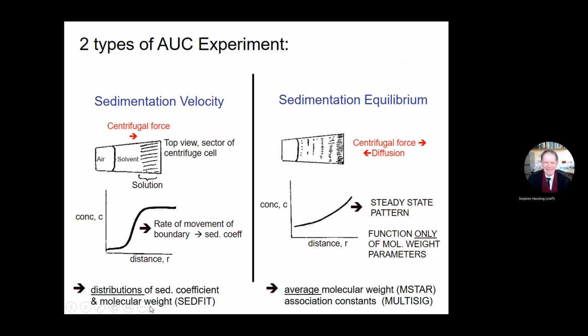If you know, remember this, the sedimentation coefficient molecular weight relationship, S equals K double prime M to the power b. Yeah, that's the power law equation. So you can get the molecular weight if you know the conformation type and correct for diffusive effects.